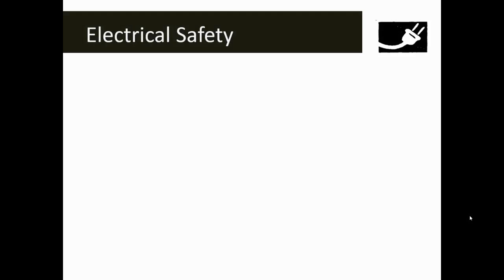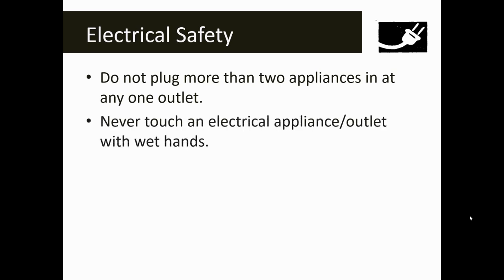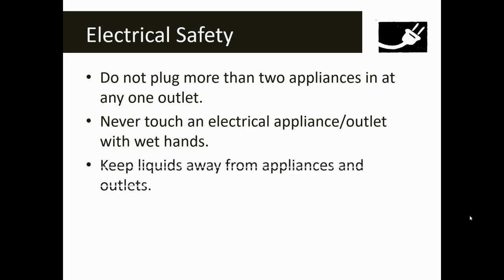If you ever have to plug in any sort of electrical appliance into an outlet, make sure that you use electrical safety. Don't plug more than two appliances in at any one outlet at a time. Water and electricity don't mix — never touch an electrical appliance or outlet with wet hands, as you could get quite a shock. Make sure that you keep liquids away from appliances and any outlets.